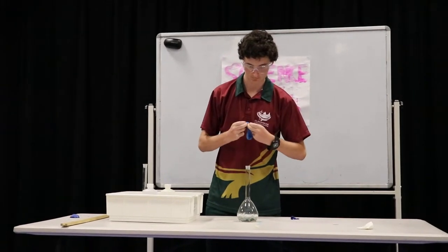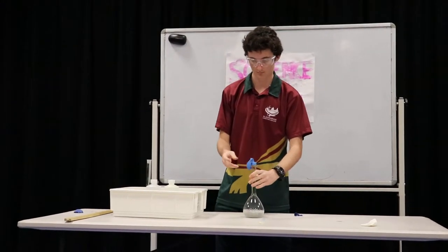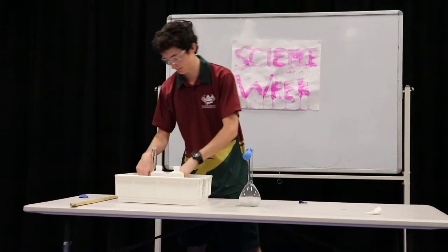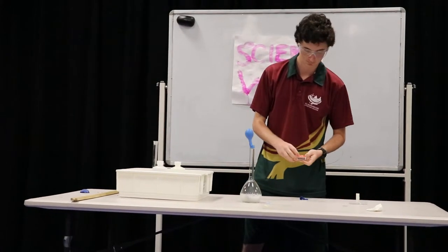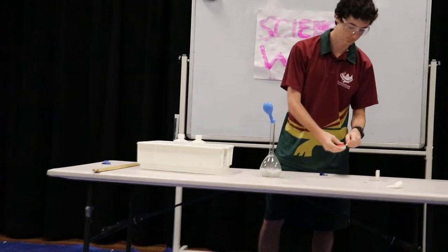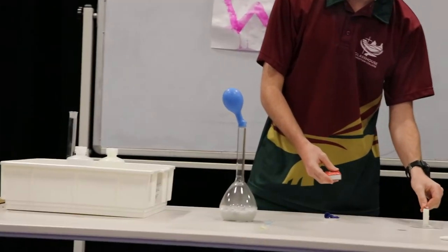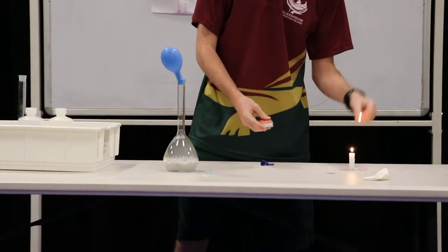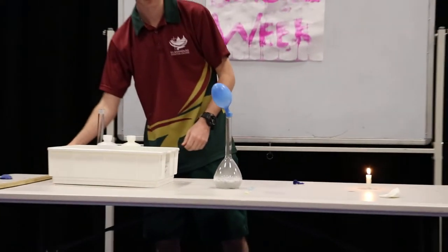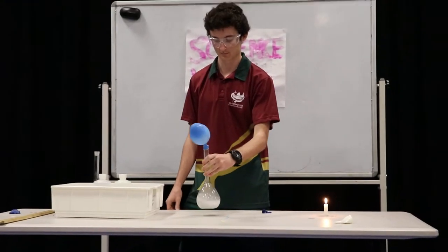He's going to collect the gas in a balloon. Now this reaction gets really hot, so that flask is going to get really, really hot in a few minutes. The gas is collected in the balloon. Hydrogen is actually the lightest of all gases — helium is the second lightest. This is the lightest gas we know of. As you can see, it produces hydrogen pretty quickly, which we can collect in the balloon. It's bubbling away there, producing the hydrogen gas.